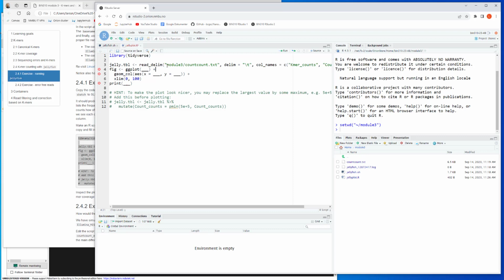Of course, you can always use the full path, like this. Then I would be safe, because this will work from anywhere in the system. I can run R in any folder and this will still work. So that is in some sense the safest solution, but it's a lot of typing. So I prefer the short version here now and hope that this will work.